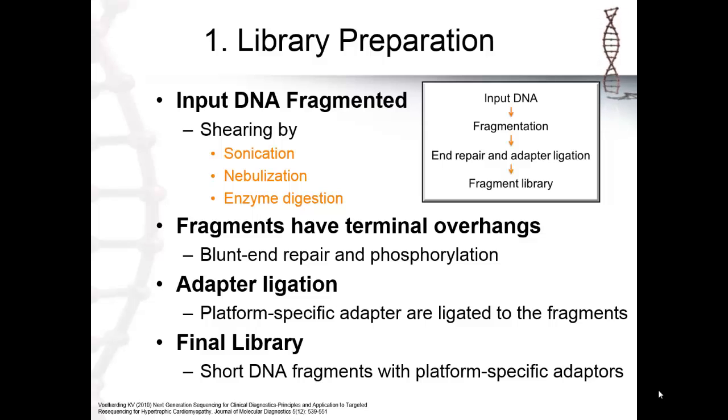The library is a collection of DNA fragments that is stored and propagated into a population of microorganisms through the process of molecular cloning. In order to prepare the library, it must first be fragmented into smaller pieces of about 300 base pairs that can be sequenced. The process of cutting up a large strand of DNA, sequencing it, and then putting it back together is referred to as shotgun sequencing.